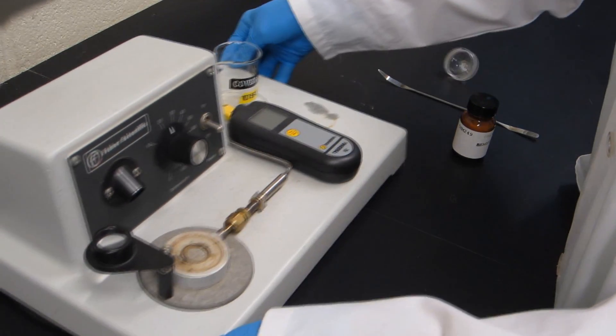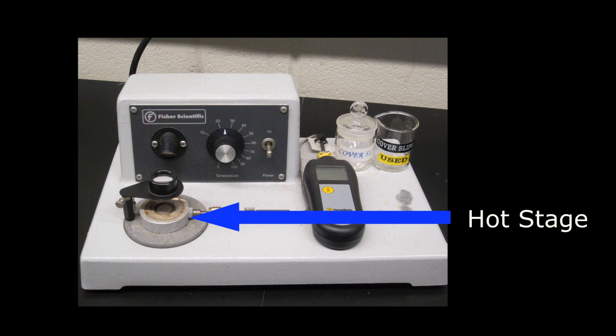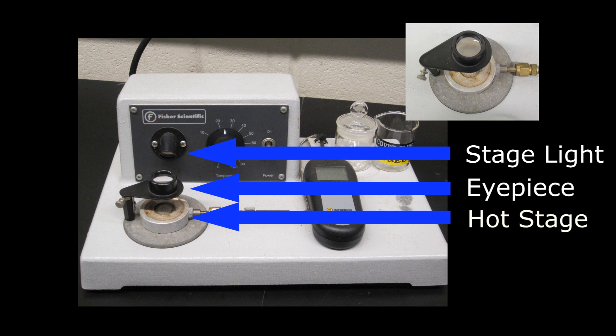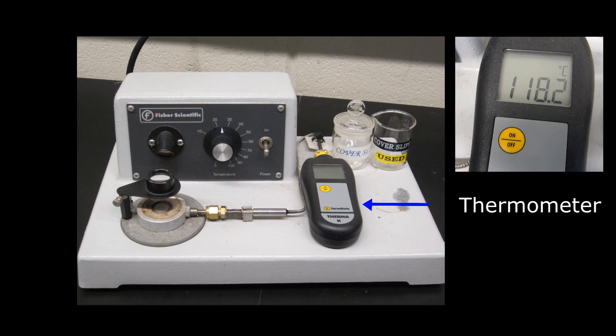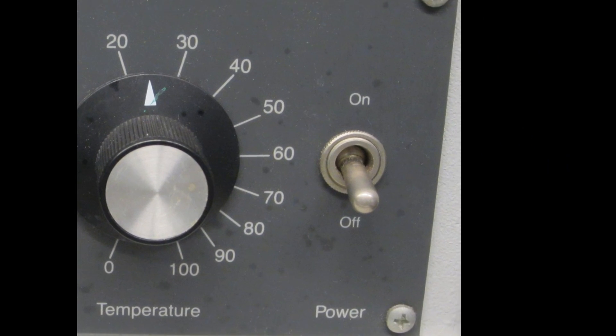This is the Fisher-Johns melting point apparatus. It contains a hot stage where you sandwich your sample between two thin glass plates and place it in the holder — this is where we will see the sample melt. It also contains a stage light and an eyepiece for observing the sample. The voltage control regulates the rate of heating, not the temperature. The thermometer notes the temperature of the hot stage, and finally there is an on-off switch.